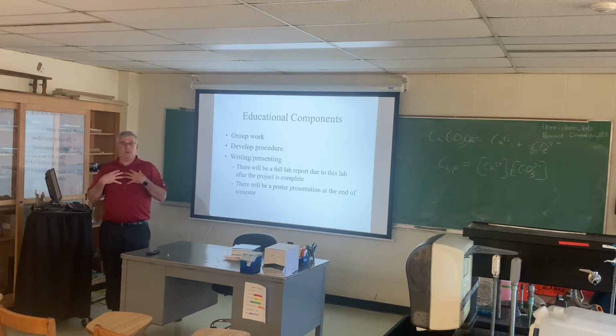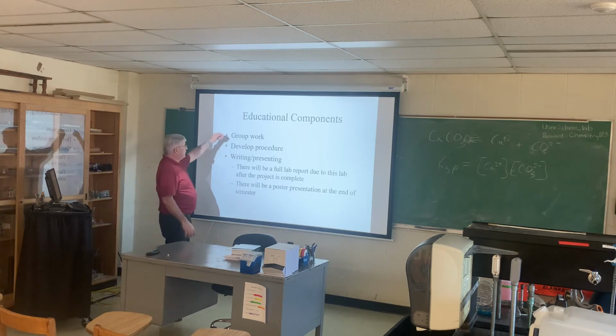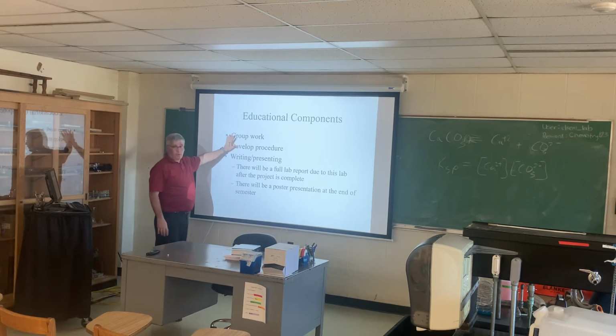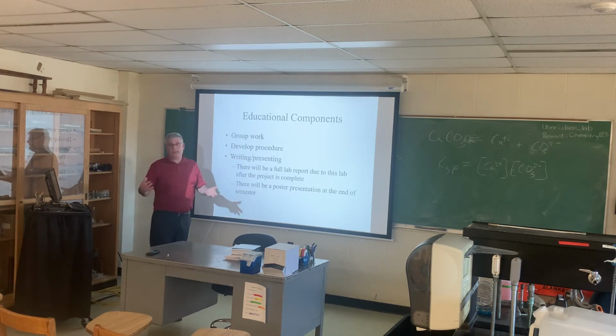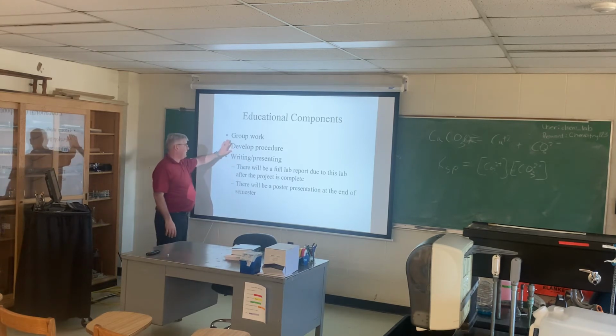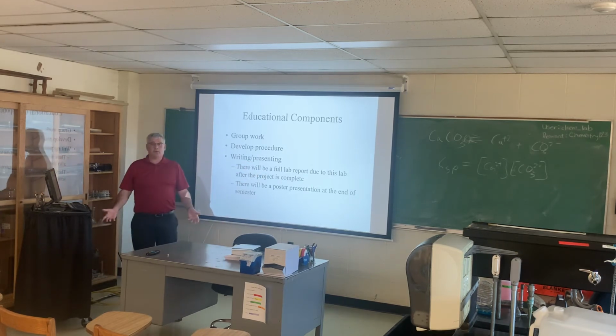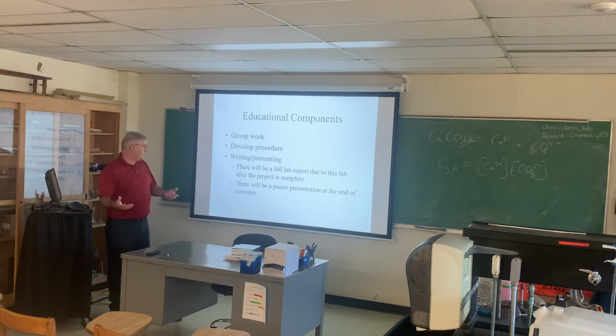The things that I want you guys to work on, educational components, is we're going to work on group work. We're going to work on developing our own procedures instead of having one given to us in an exact format as we normally do in general chemistry labs. All right, so you're going to develop your procedure. You're going to write your procedure that you're going to use specifically and give that to me. All right, and then obviously we're working on our science writing and science presenting, or what we would call science communication.